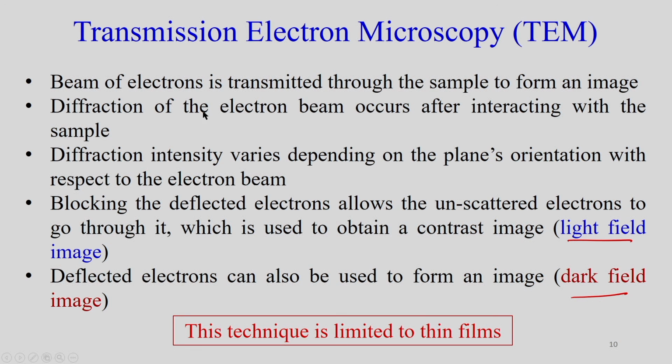So, as electrons need to transmit through the sample, this technique is limited to nanoparticles or thin films. So, this is very much limited to the nanoparticles and the thin films.